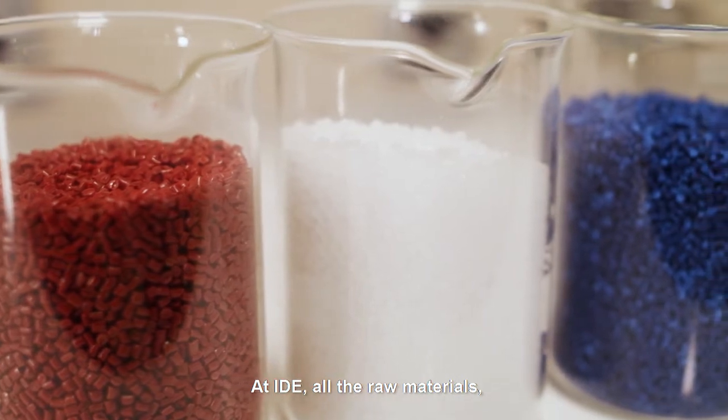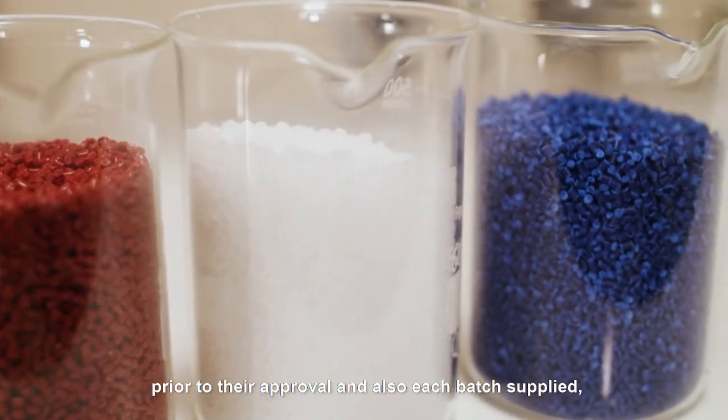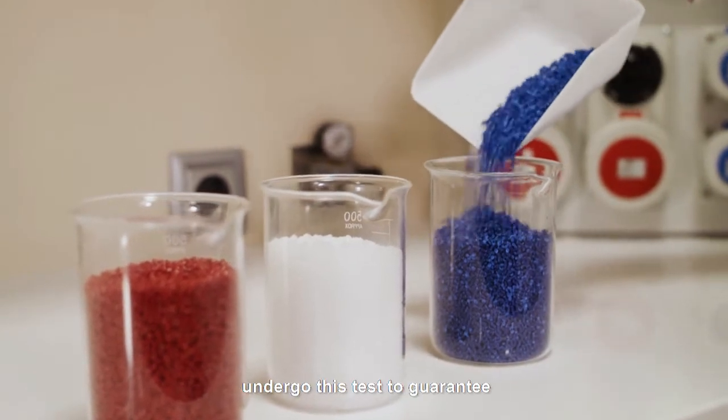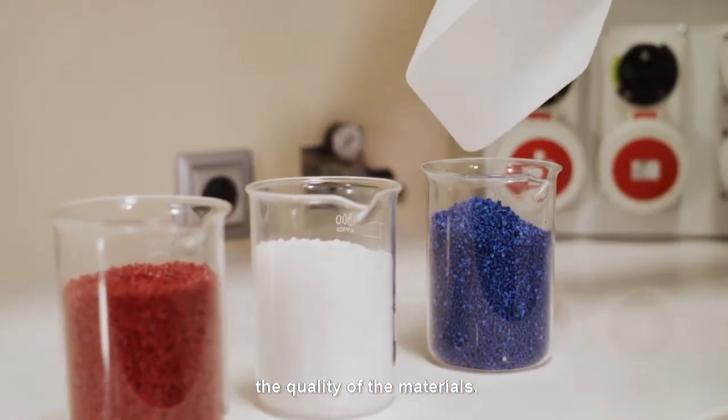At IDE, all the raw materials prior to their approval and also each batch supplied undergo this test to guarantee the quality of the materials.